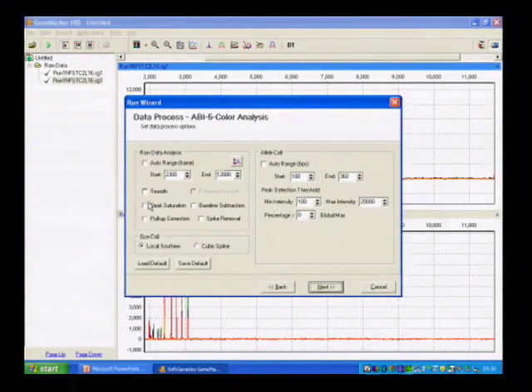For the case where one is using the software in an automated fashion, I believe this package has macros that one can implement. So for example, in this portion, I could have clicked on smoothing, peaks, saturation, and so on and so forth.